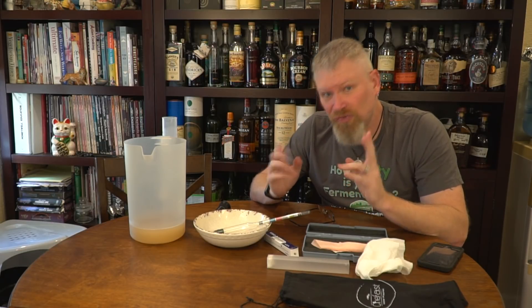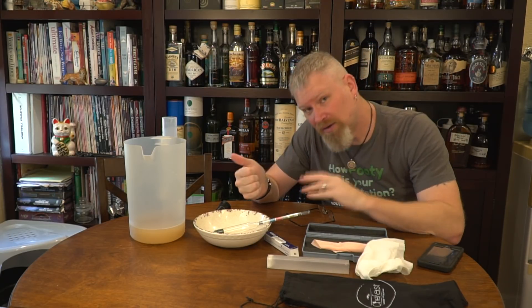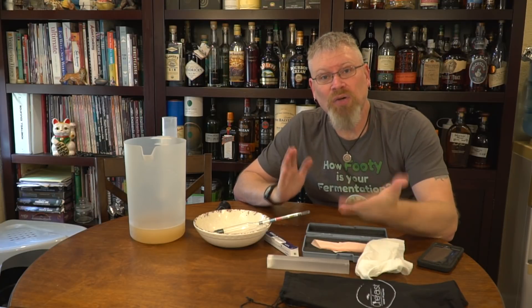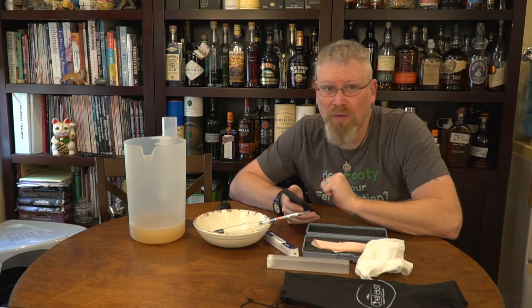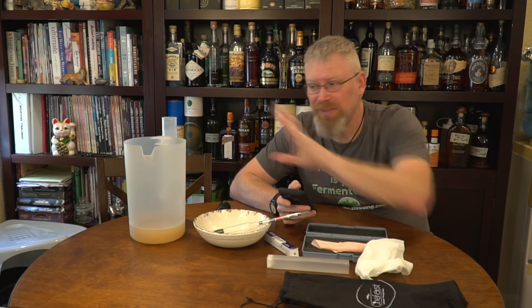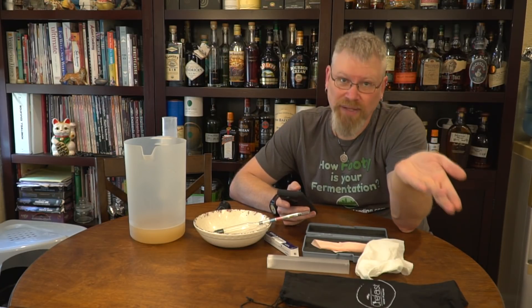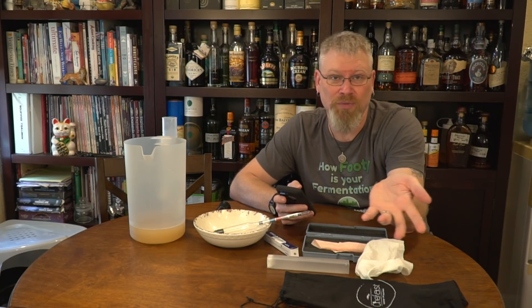Anytime you're doing readings, you want two readings: an original gravity and a final gravity. The original is when you're brewing, when you're putting it all together, and the final gravity is when it's done. The final gravity determines how much of the sugars were actually burned up. There's a very simple way to figure out how much alcohol was in there. Let's say this started at 1.042 and went to 1.000, which is neutral — it means almost all the sugars were used up. Technically, if all the sugars were used up, it would be below one because alcohol is lighter than water. Essentially, you look at how much sugar was consumed to calculate approximately how much alcohol was produced.